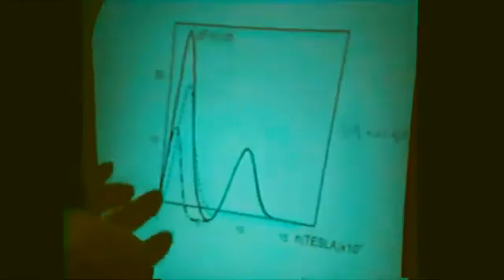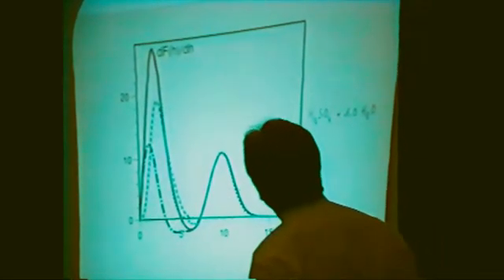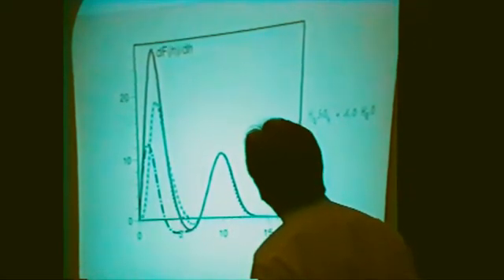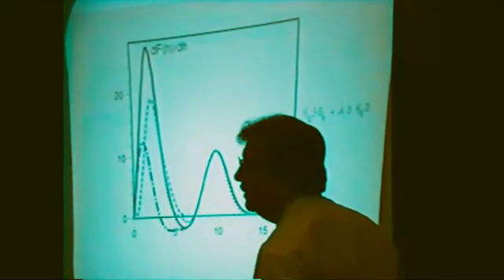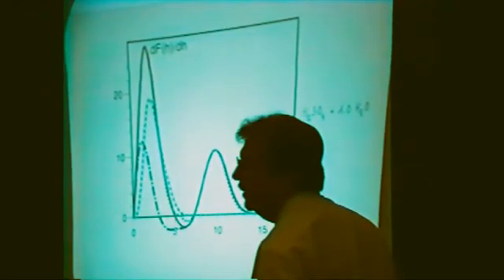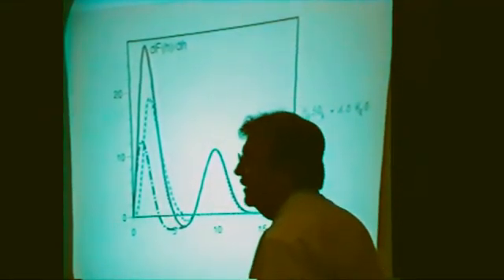And when you have exactly one water molecule adsorbed per sulfate group, you see that you have hydroxonium ion and residual OH group concentration, for such a perfect simulation. Now if you adsorb more and more water, you don't change the spectrum, except that you add more and more of the compounds corresponding to free water. That means, of course, we have found exactly what you know, that you have a very strong acidity for the first OH group and a very low one for the second.